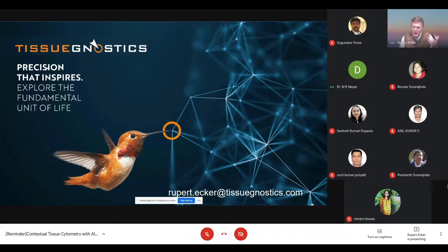I'm sure you are aware of one company called Incel DX from USA. It's a flow cytometry based solution for cervical cancer screening in low resource settings, where HPV infected cells can be categorized beautifully, and it will be very useful clinically. I'm not sure whether your company is working in that area, because there's a lot of potential for screening of cervical cancer using this imaging system in India as well. Are you working on screening HPV infected cells in developing countries or in the Indian population?